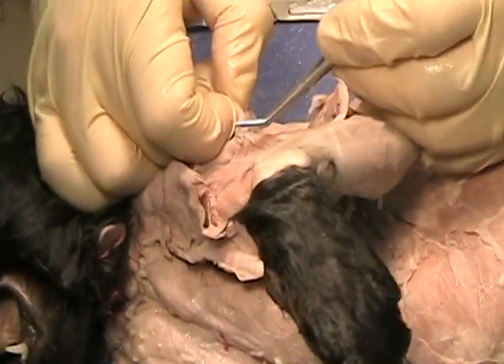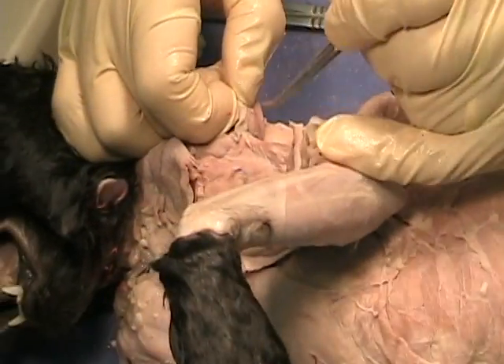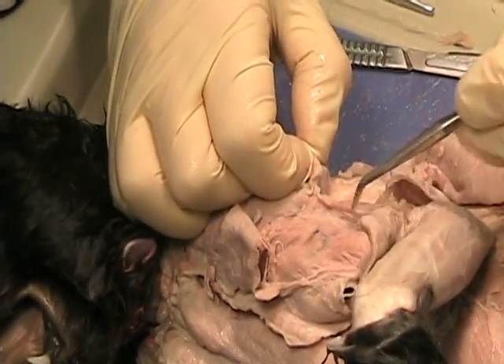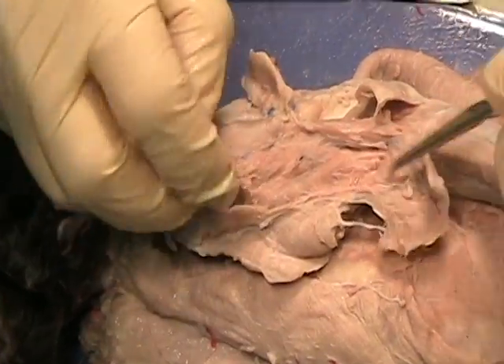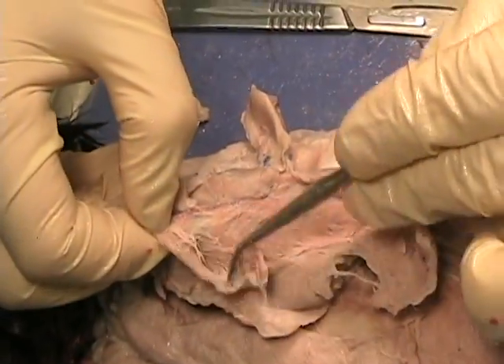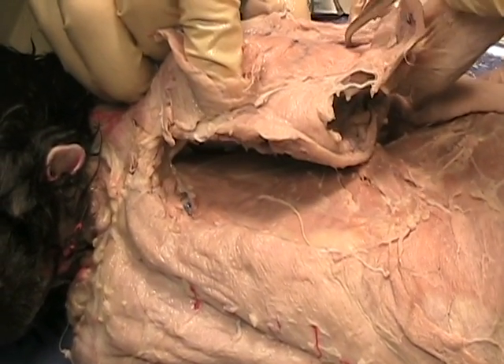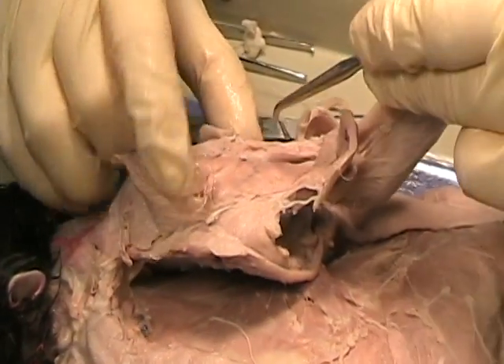You could probably leave this alone, but in a lab practical they probably want you to identify it. Here's our brachialis. There's a whole bunch of muscles coming across here — we've moved the clavobrachialis out of the way. These muscles are actually our pecs, which are coming across and inserting onto the humerus. Here's the humerus right here.